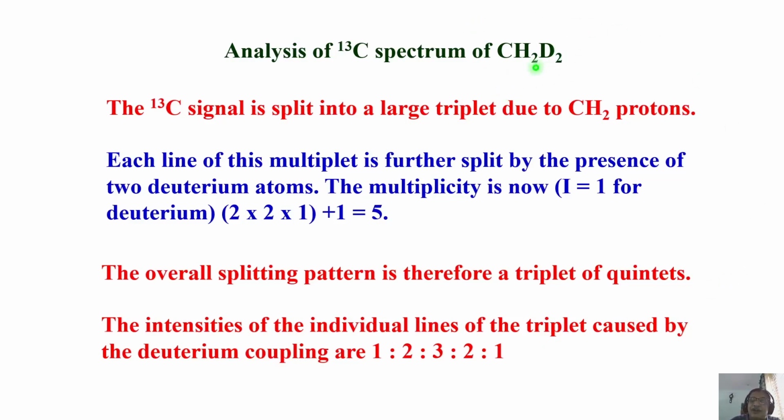Now I can also ask a question. What happens if I look at deuterium? I looked at the proton spectrum. I looked at the carbon 13 spectrum. Now I'm going to look at the deuterium spectrum. What do I get?